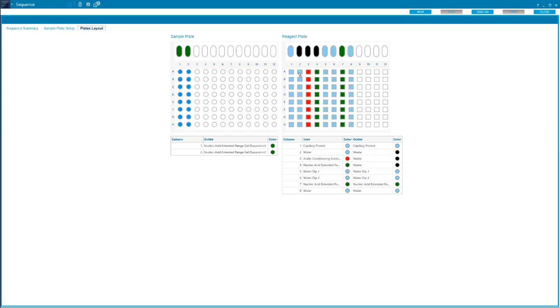I like to group all my waters together in the front, my rinse buffers in the middle, and my gel buffers at the end. For the outlet, I like to group the waters together, waste in the middle, and gel at the end. Once we save this sequence, we go back to the BioPhase front panel to import our method and finalize the instrument setup.